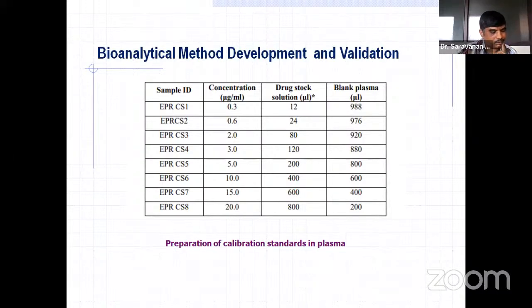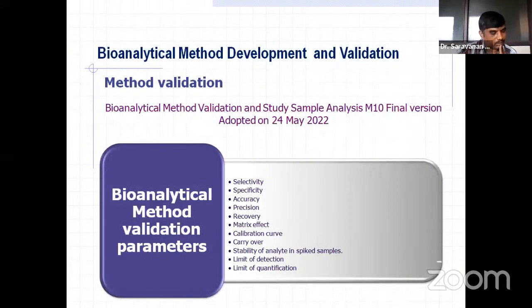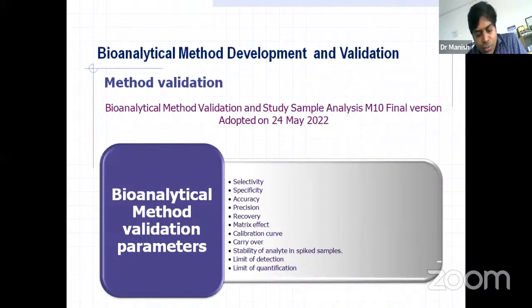Thank you, sir. And another question is from YouTube. Why is sodium chloride added before centrifugation? Yes, very good question. Sodium chloride, or sometimes sodium hydroxide, is added. We know that the drug gets bound to the proteins. So the protein should release or withdraw the drug from its surface. Here the sodium chloride breaks the bond between the protein and the drug and makes it move towards the aqueous phase, that is your mobile phase. So that's the reason we add sodium chloride before the centrifugation process.